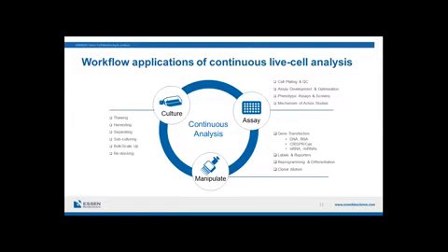Okay, so just thinking about that kind of continuum of cell culture, cell manipulation, and phenotypic assay, I've tried to list on this slide a few of the workflow applications where continuous live cell analysis adds value. I won't go through them one by one, but they're clustered as cell culture activities, cell manipulation activities, for example, stem cell reprogramming or clonal dilution, and cell assay activities, starting from quality control and cell plating through the detailed mechanism of action studies.